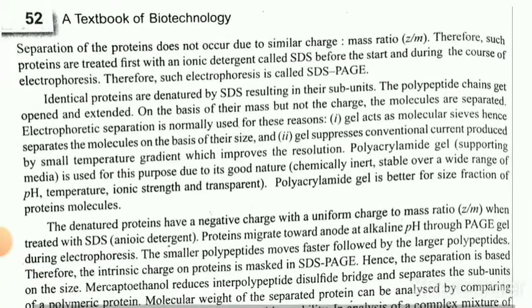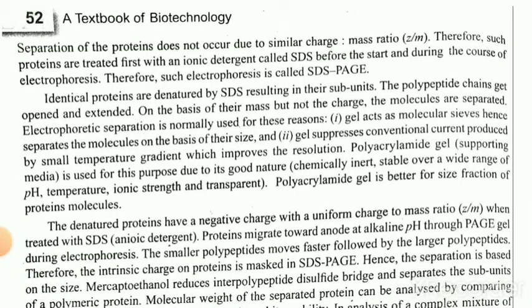Therefore, such proteins are treated first with SDS before the start and during the course of electrophoresis. Identical proteins are denatured by SDS, resulting in their subunits. The polypeptide chains get opened and extended. On the basis of their mass but not the charge, the molecules are separated.